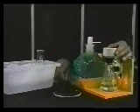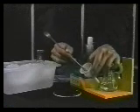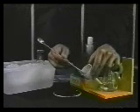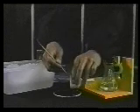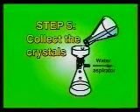Remove the Buchner funnel and use a spatula to transfer the crystals to a watch glass. In this step, any boiling stones which remain from the crystallization procedure may be physically separated from the crystals. Once the crystals have air dried, the product is ready for characterization. This recrystallization worked well. Let us again review the steps in the recrystallization process.